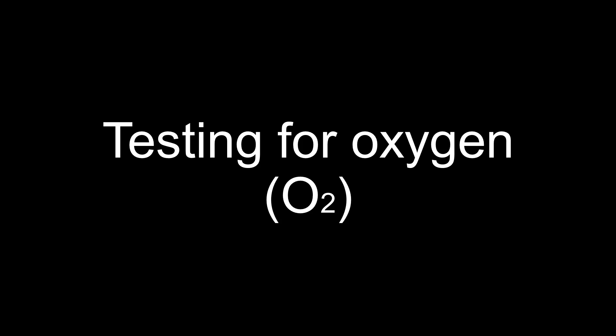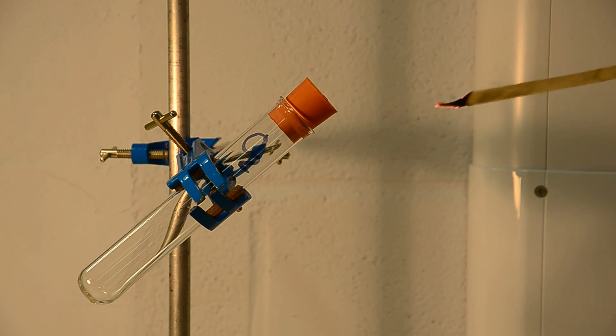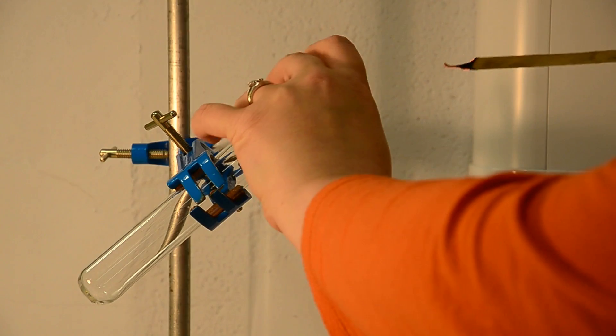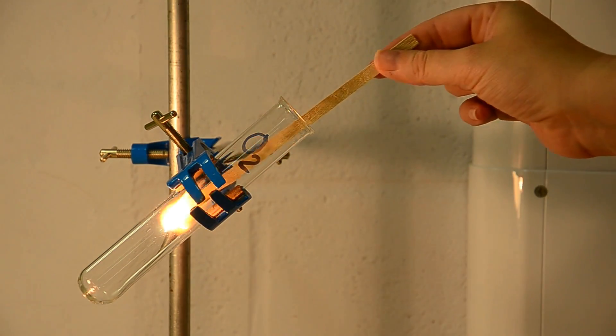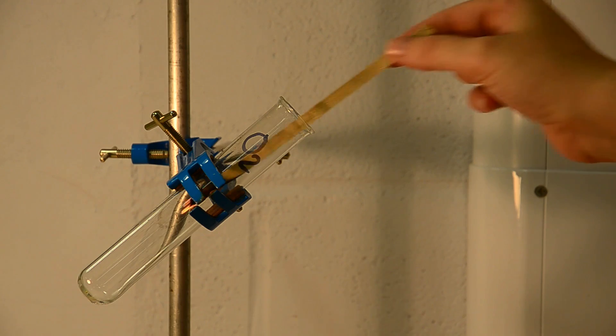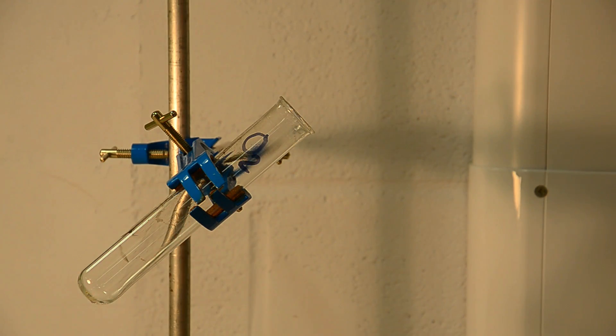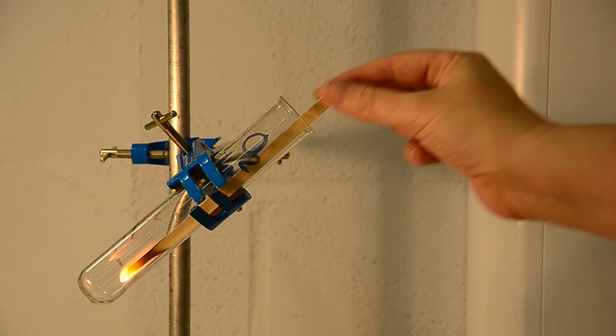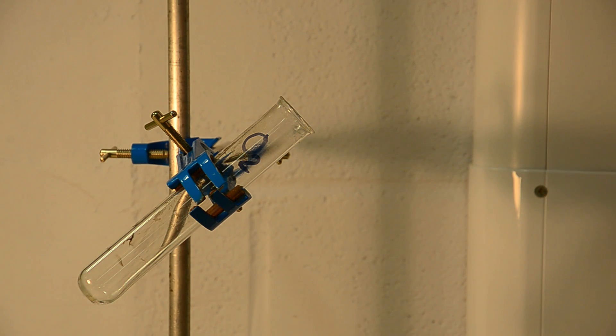The second test we'll be looking at is the one for oxygen. Here I've got a tube of oxygen gas and a wooden splint which I've blown out. As you can see, oxygen being the gas that's vital for combustion, the oxygen relights this splint. So the key points are the splint is glowing and the oxygen relights it.